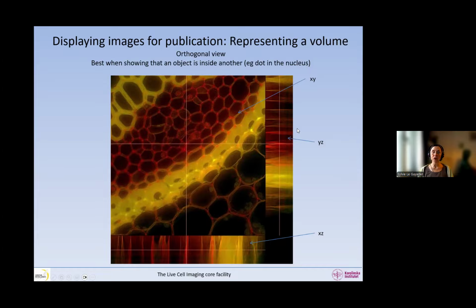And which plane it is, the place where this bar is located. By default, if you click on that view in your software, it will come up to the middle of your stack. But that might not be the place where you want it to be. So in your software, you can move this bar up and down, and this image will change. The rest will not change, but this image will change because the image displayed here will be the one where the bar is.